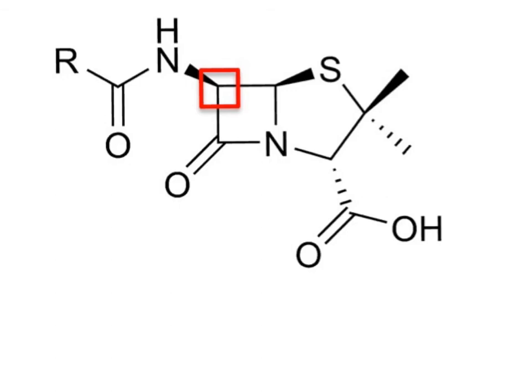We are going to start by tracing out the expected COSY correlations, which I'm going to show in red with my double-headed arrow. So I'm going to sketch in, for clarity here, my proton. And I'm going to show, also just to keep track of things, the protons that are vicinal to here. And in this case, we actually only have one vicinal proton, because if we look at the adjacent carbon atoms, there'd be an adjacent carbon atom here, and that has one proton, so that's vicinal. We come over to here, there's no hydrogens directly bonded here, so no possibility of correlation.